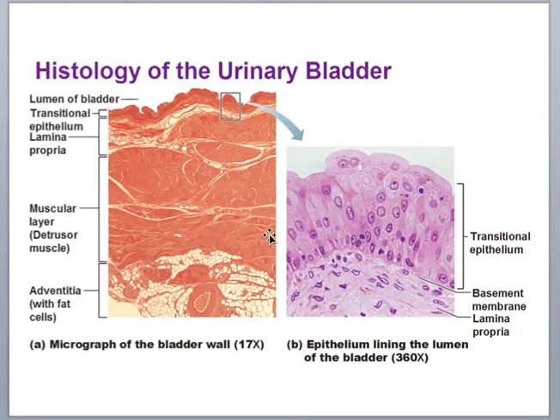The bladder, you should be able to identify the bladder on a histology slide. This is relatively easy. You find transitional epithelium, which is also present in the ureters as well, but you don't have to be able to identify ureter. But the bladder, dead giveaway is this type of epithelium, transitional epithelium. It's called that because it looks as if it transitions shapes as it moves up. It looks somewhat cuboidal, and then they look fluffy and kind of balloon shaped, and then these outer cells on the apical surface are really fluffy and balloon shaped, and these are called dome cells.